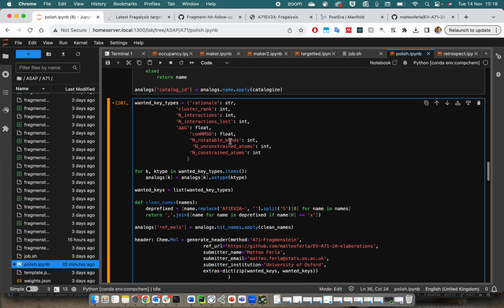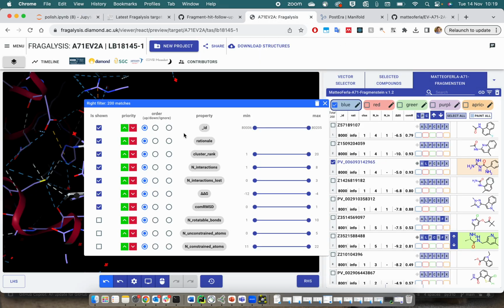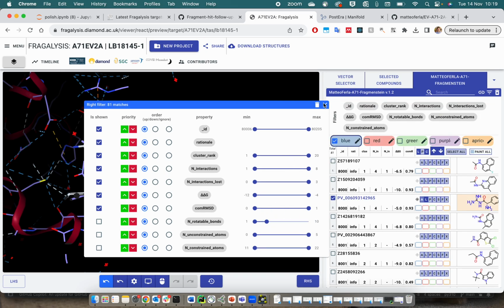I should stress that in the case of integers, or similar, or floats, if there's a NaN value, a float NaN, not a number, it will become None and will break the filtering. So please change all not-a-numbers to whatever illegal value, max out value you want, say 999. Because, as I said, you can filter based on various things, and it would be a shame to lose that ability.